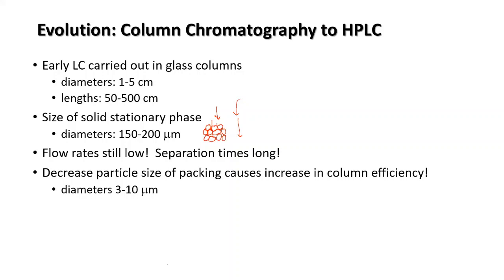But the benefit of decreasing the particle size is that the separation will be nicer. You know that if you decrease the particle size, your overall surface area is increasing. Suppose you have a lump of 1 gram of particle, and you break it into very dust particles, and it is also the same mass.